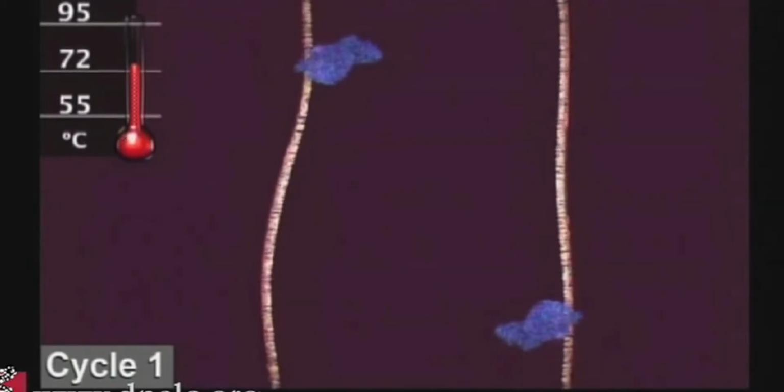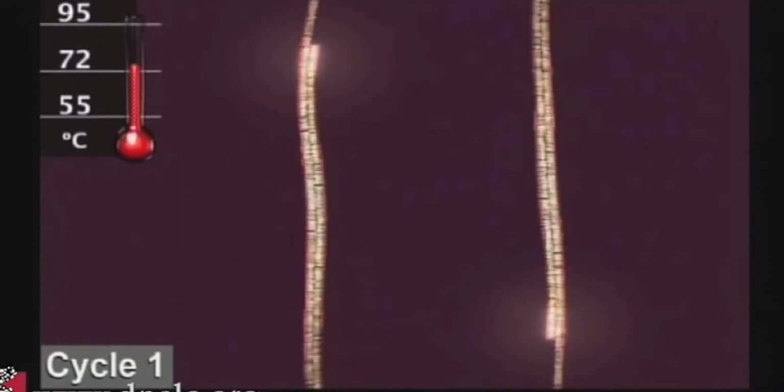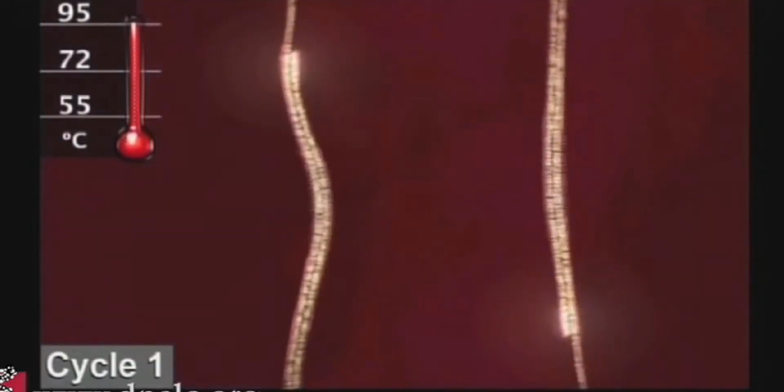At a slightly higher temperature, the enzyme Taq polymerase, shown here in blue, binds to the primer sequences and adds nucleotides to extend the second strand. This completes the first cycle.